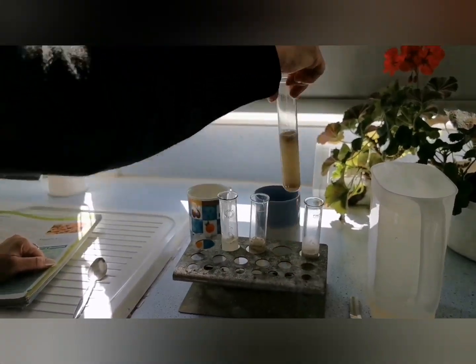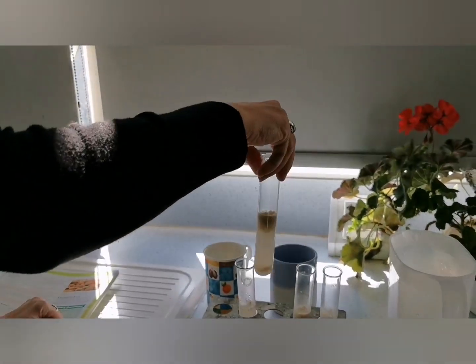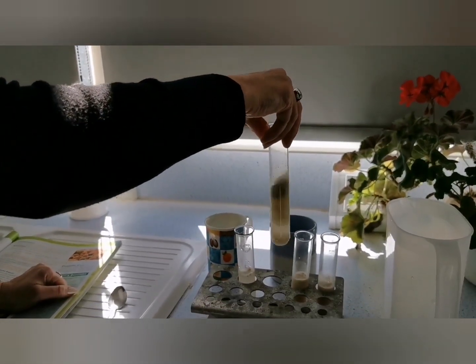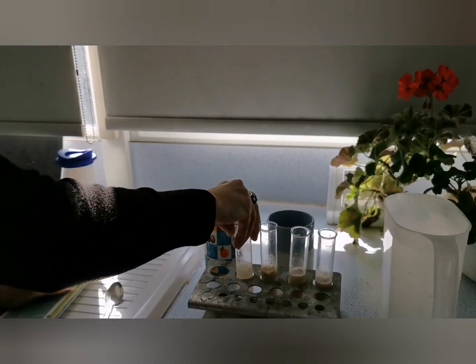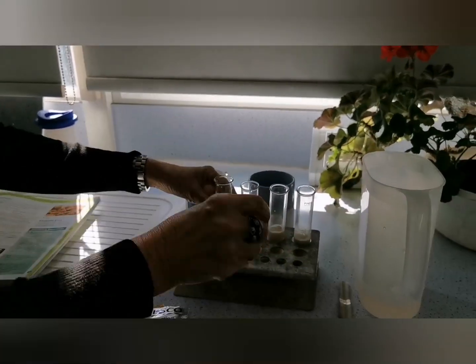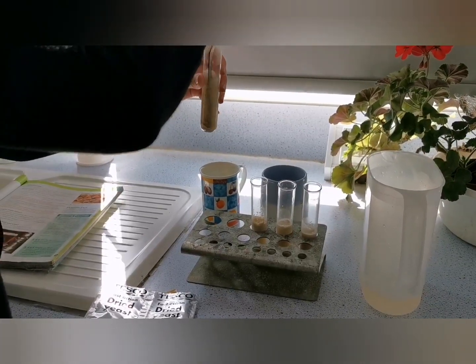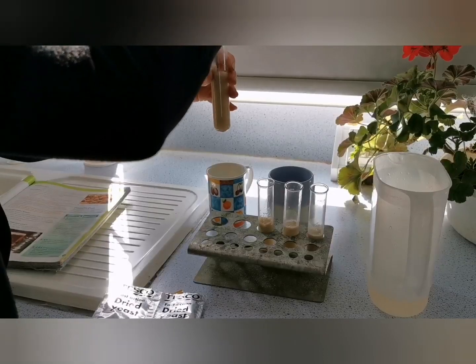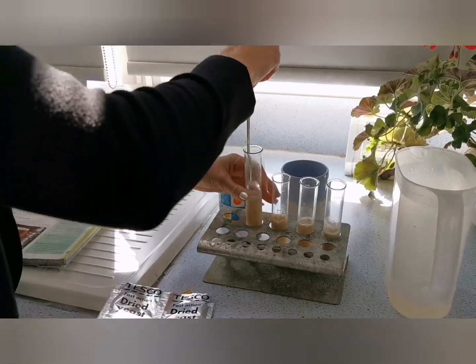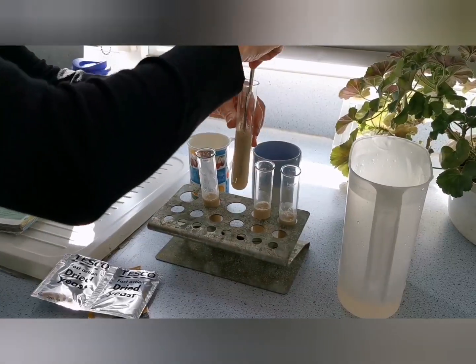So we give that little swirl around, mix it up. Again, we're going to do the same to every single test tube to try and keep our controls the same. I'm actually going to just give that a little stir just to make sure that sugar is dissolving. So it's just slightly warm water just to help the sugar dissolve.